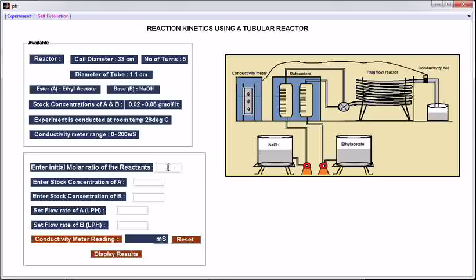Let us come to the experiment part. Enter the initial molar ratio of the reactants — let us enter a value like 1.1. Enter stock concentration of A; stock concentrations of A and B should be in the range 0.02 to 0.06, so enter 0.03. Enter stock concentration of B: 0.035. Set flow rate of A — let us enter 10 lph.